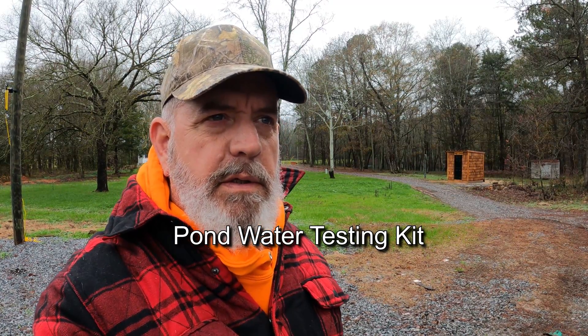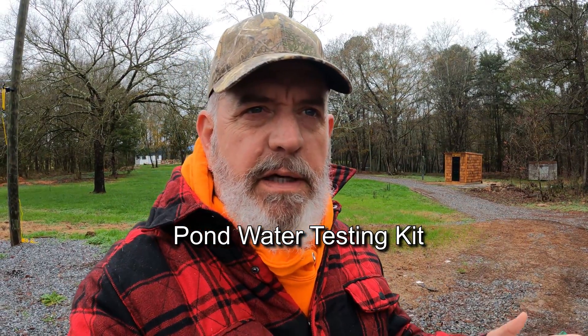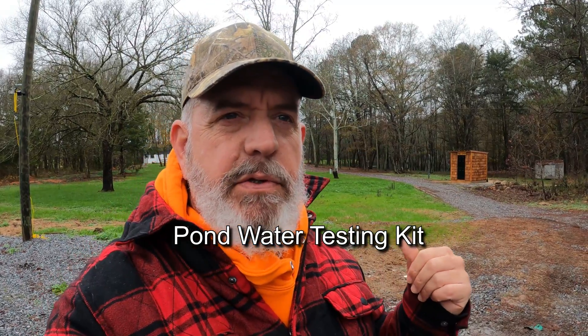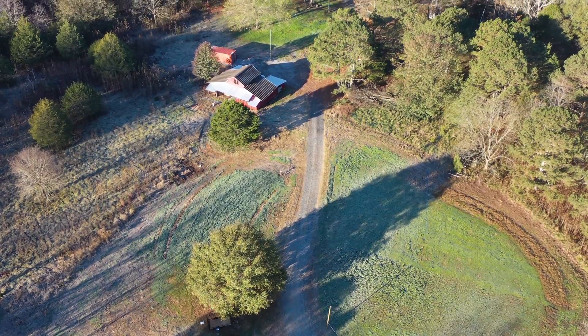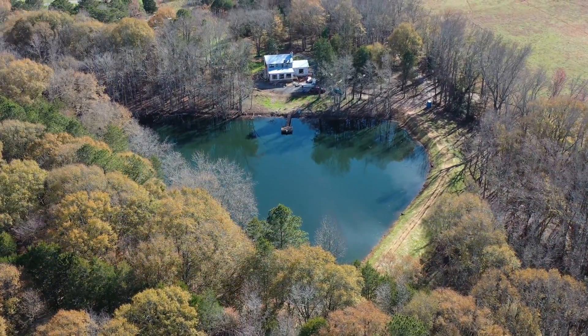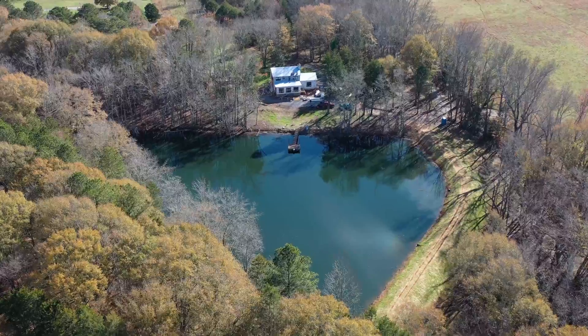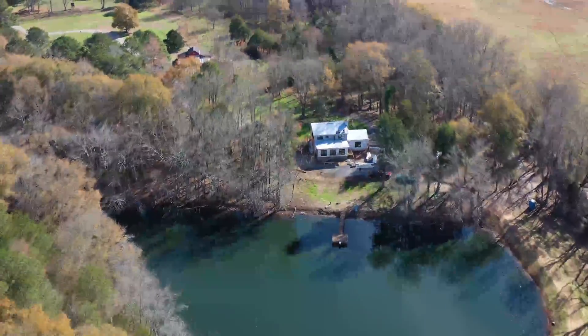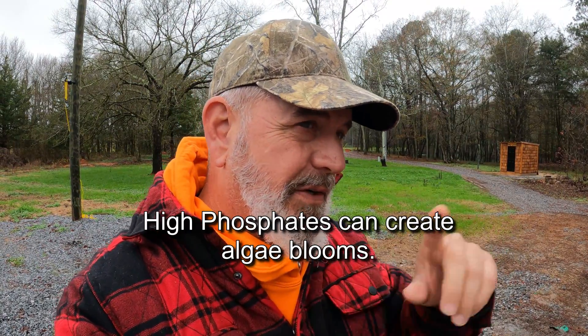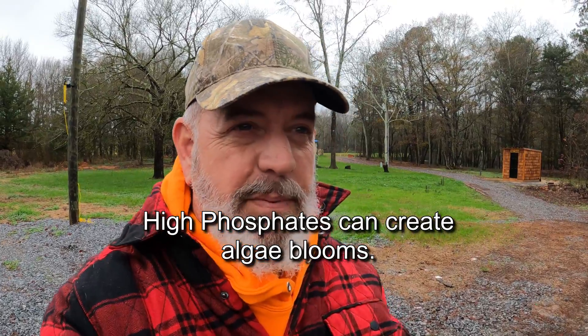Good morning. Today I'm up at the farm property and we're going to do a video on testing pond water. I'll show you a kit that you can buy online. We have high phosphorus up in our fields and that does drain over into our pond. The pond is fed by a spring but it does get runoff, so my main concern today is pH but mainly phosphates.